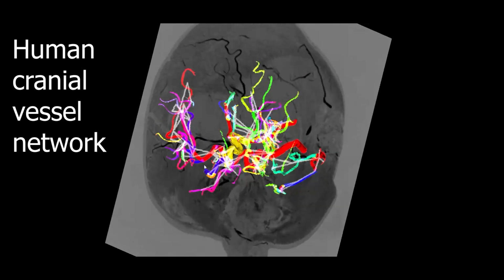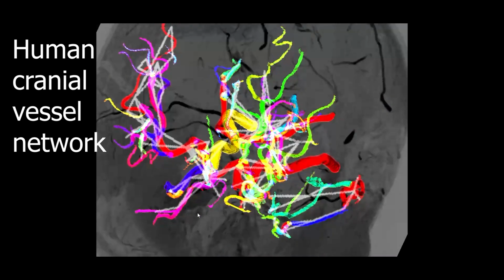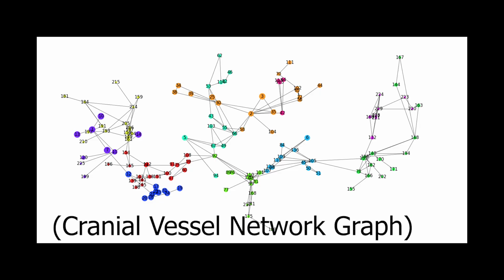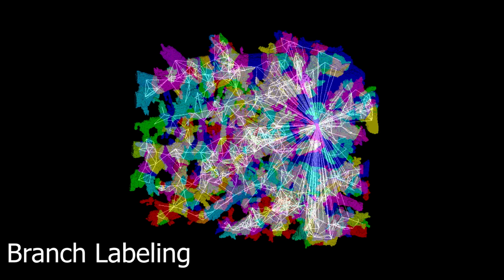So if you were trying to establish some kind of quantitative analysis for a paper or create cool looking 3D overlays and figures, those are some things that this is good for. The way it works is it is designed to take 3D images and convert them into networks mainly, and it also has a variety of other morphological and spatial analysis options.